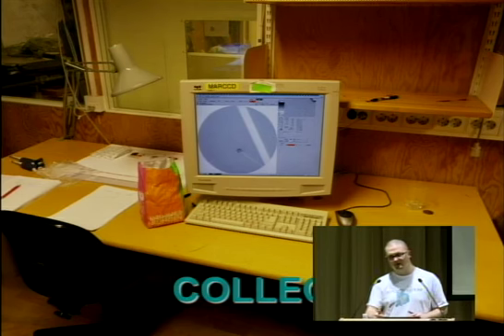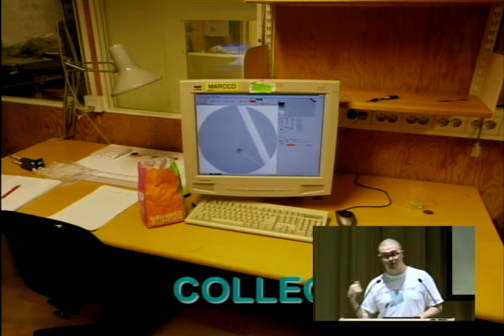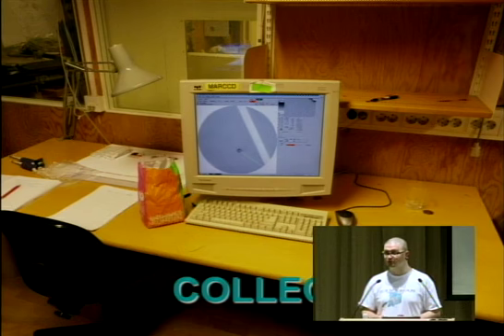You save your file under a certain name, and after you collected the scattering from the sample, you go back into the hutch, wash the sample cell, dry it, and load your buffer. Then you exit the hutch and repeat the measurement for the buffer. With exposure times of 10 minutes back then, it was quite an annoying procedure.